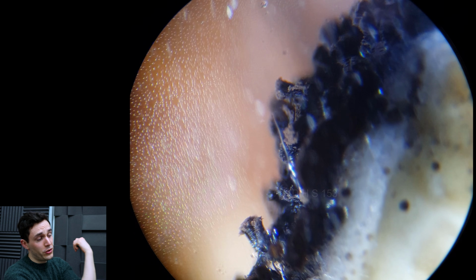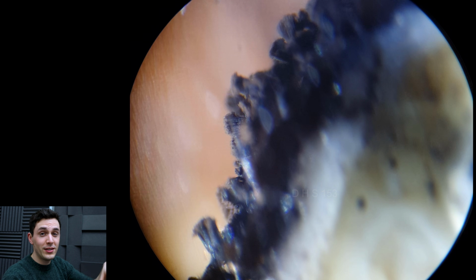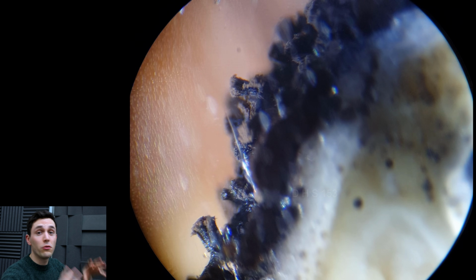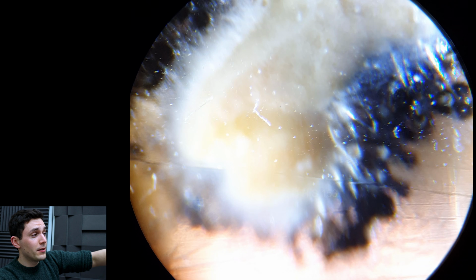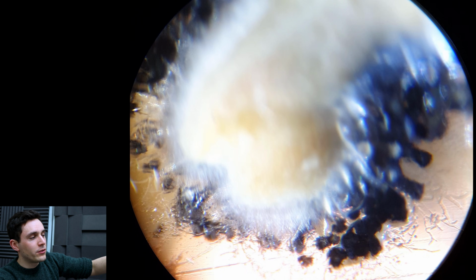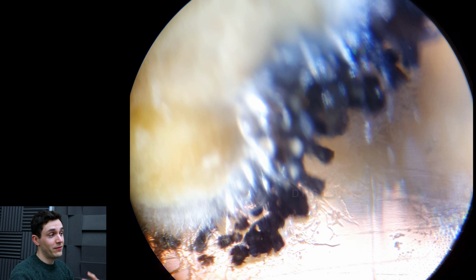And in case you're wondering, yes, this is the type of fungus that can make you sick, make you ill, so you should definitely not do this. By the way, just to give you some context, we've now zoomed up a little bit, and this is the piece of infected earwax, which is not really earwax anymore. It's not even the color of earwax.